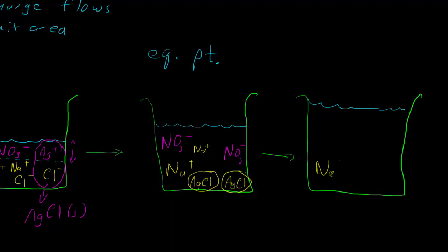So our sodiums that we had initially are still there, they're just hanging out, but now we've added extra silver ions and nitrate ions, and so we've got a bunch of those guys floating around in here now that we're past the equivalence point. And so now we're starting to increase the number of ions. We've added a little bit more volume, but now we've increased the number of ions in here. So it might be that the conductivity is going to change again. Maybe in this case, the conductivity goes up.